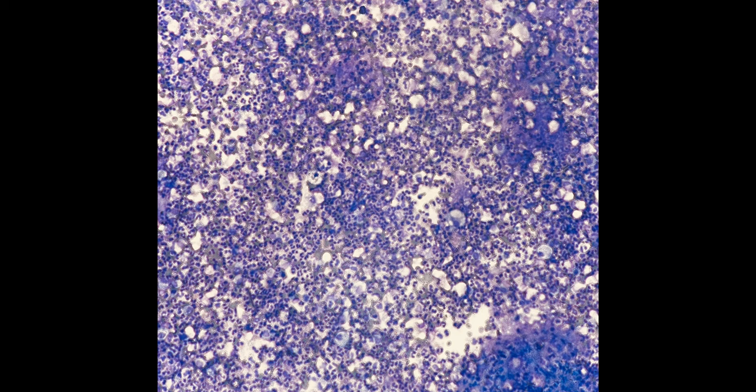So with a lot of newts, as you can see here, differentials include idiopathic pulmonary fibrosis, bacterial infection, asbestosis, collagen vascular disease. If we saw a lot of eos, we'd be concerned for eosinophilic pneumonia, eosinophilic granulomatosis with polyangiitis, allergic bronchopulmonary aspergillosis, or a drug response. And for lymphocytes predominant, we can expect hypersensitivity pneumonia or TB. So it's important, that's why we give the percentage of the background inflammatory composition.